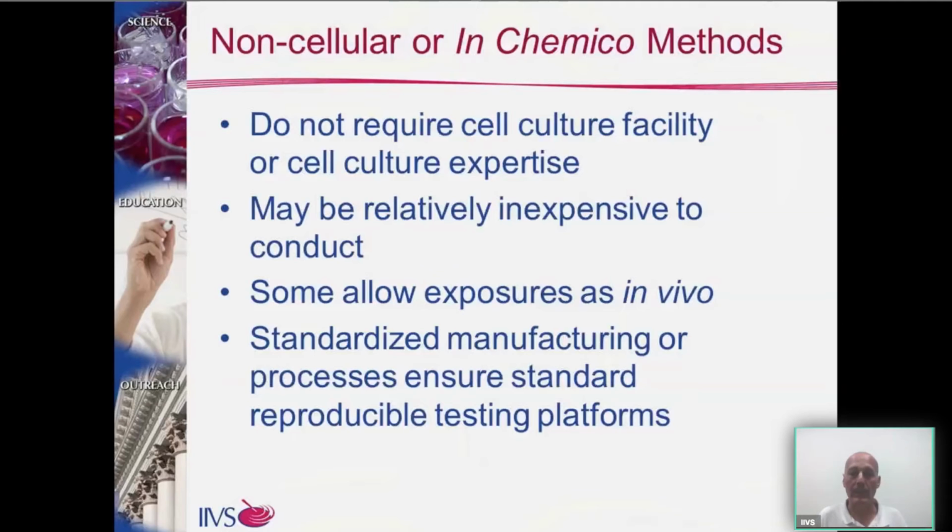Some of these test methods allow exposures as in vivo and may have a topical application approach. And finally, the standardized manufacturing processes used to prepare these tissue models, or these non-cellular models, are very reproducible.